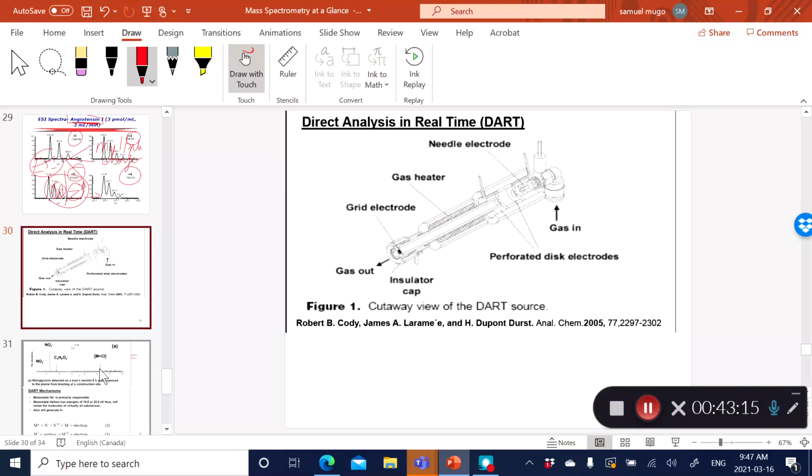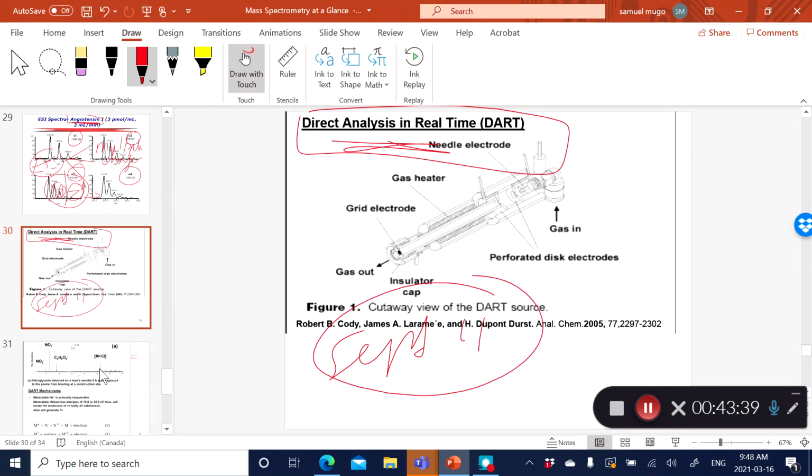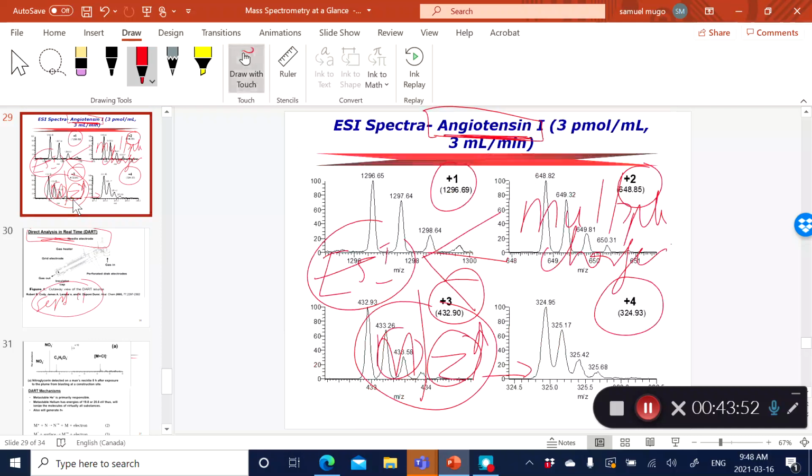So very quickly, the other types of variations of desorption techniques. There are many types of variations out there of desorption techniques, such as this thing that is called the DART. Now, remember, these techniques were being developed after September 11th, all right? And so the issue of homeland security became such a big deal. And people thought, ESI or mass spec is such a versatile technique. And also remember, the ESI is happening without a vacuum.